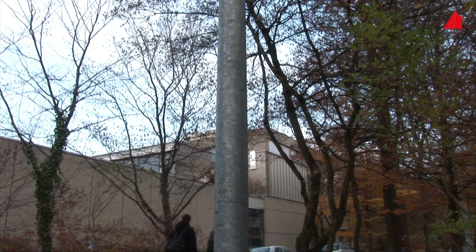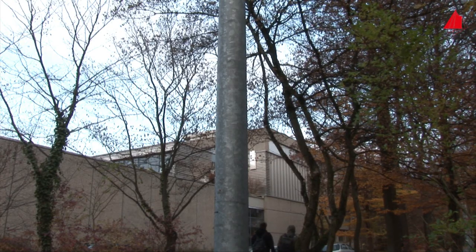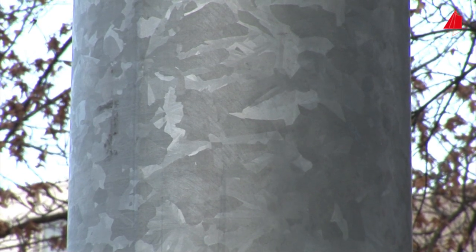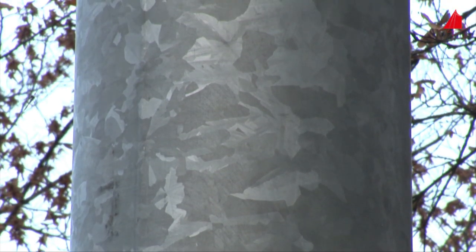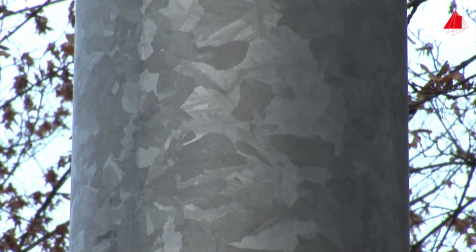Even in everyday life, one meets metallography. At this hot-dip galvanized lamppost, the rainwater has acted as an etchant over the years. The large flat zinc crystals have been structured on the surface and can be recognized as so-called spangle.